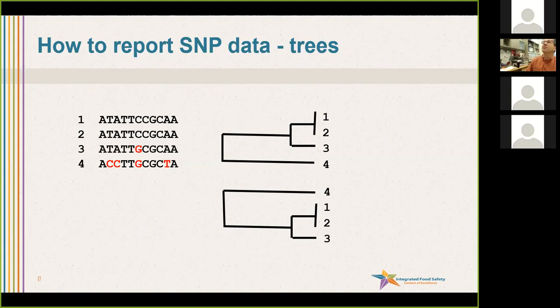The important thing to remember when you look at trees: don't look up and down. Don't say one and two are similar, then two is similar to three, three is similar to four — because these trees you can rotate. Every time you have a node you can rotate it. So if you look at the bottom, I took the same tree as on the top and simply rotated it. Now four is next to one, even though four is very different. Resist the temptation to look up and down and just see what's next to each other — you really need to look at the common ancestor node that connects two things to interpret those trees.